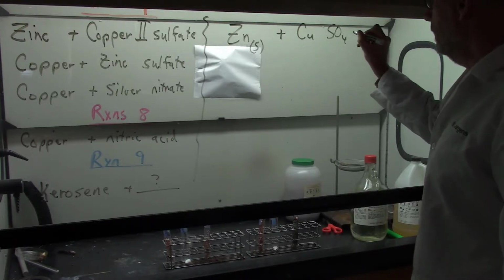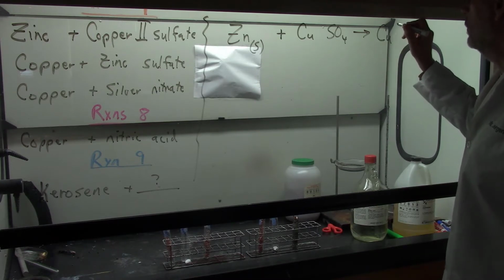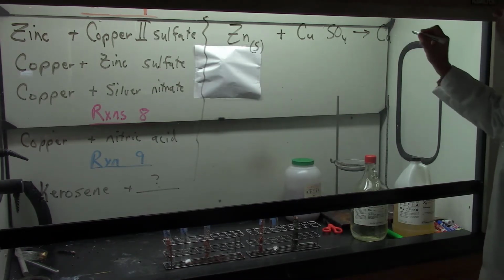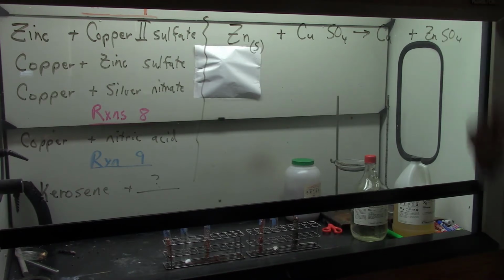That's a reaction did indeed occur. Solid stuff that's in the bottom of that test tube now, it's reddish in color. That's copper, Cu with a 0 charge, just plain copper like a penny is made out of. And then we have some sort of zinc sulfate, SO4. So zinc, it's from the middle of the periodic table. I don't know what the charge is. Wait, I do know what the charge is. It's on my flashcards. It's a +2. Sulfate is a -2, +2, oh, we're good.